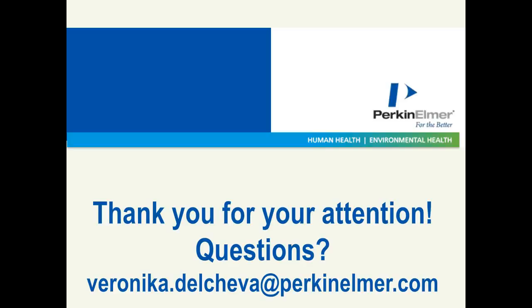Okay, great. Thanks, Julius, and I think that's clear. I'm going to direct another question to Julius, if you don't mind. This is from Montserrat Serra at the IRB. Montserrat's comment is that I used to work with membrane proteins in detergent micelles. They run very noisy in SDS-PAGE gels when the detergent is high. Would these samples run any better with the LabChip technology, Julius, based on your experience?